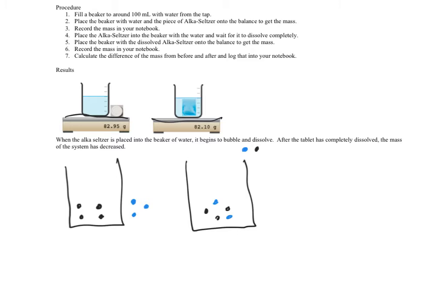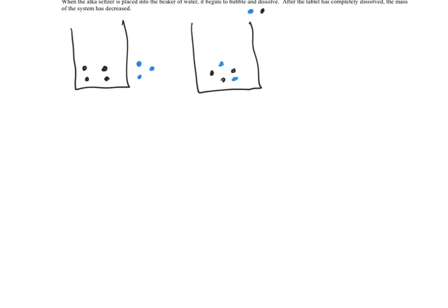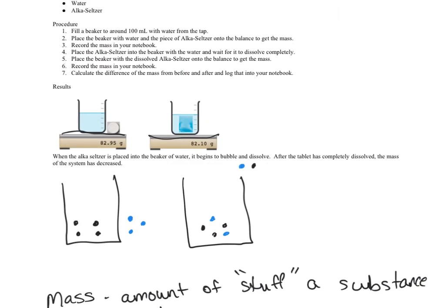Okay. Actually, before I do that, I'm going to define what mass is. Okay, so mass is the amount of stuff a substance contains. Right? We can measure mass by using a balance of some sort, right? So I was using a digital balance here.